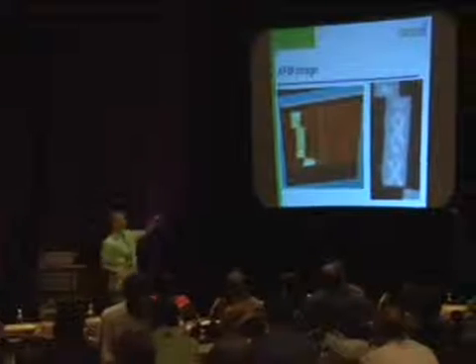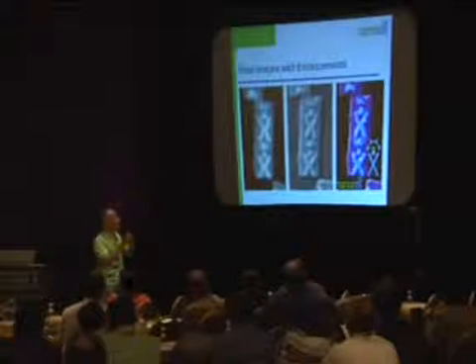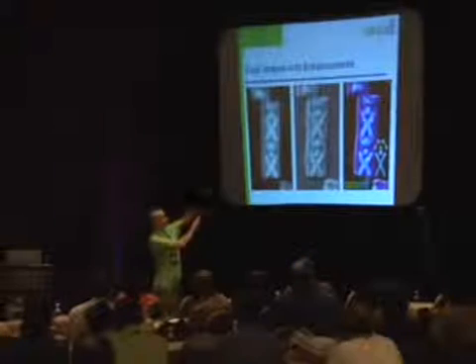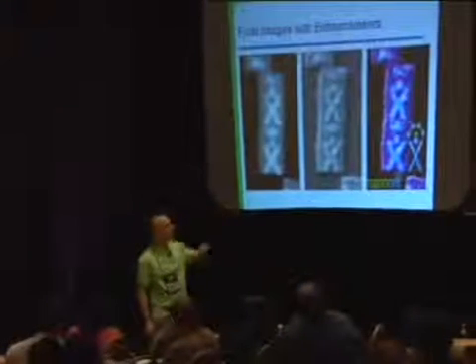So this is actually the image that she got. This is the raw data on the right, and we used some image processing to really draw out the 3D image. And these are actually two origami tiles stacked on top of one another. But you can make out the Nanorex logo.